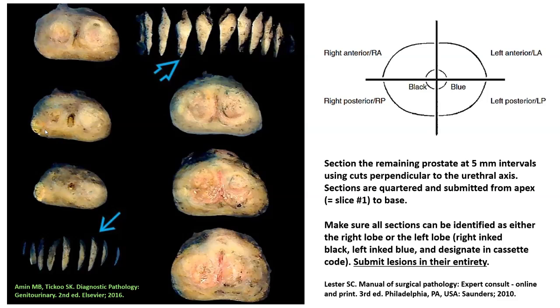So you have to submit the entire prostatic cancer that you see grossly, including the dominant nodules as well as the smaller nodules. You have to be able to segregate out the areas of the benign prostatic hyperplasia from these carcinomas. That is not a very easy thing to do. And keep another thing in mind, that the areas which look more or less normal in gross might turn out to have malignancies microscopically. So the best way would be to submit the entire prostate, but again, cost will dictate the approach that you choose. Quadranting out these particular levels is important.